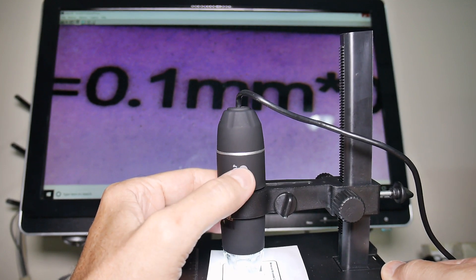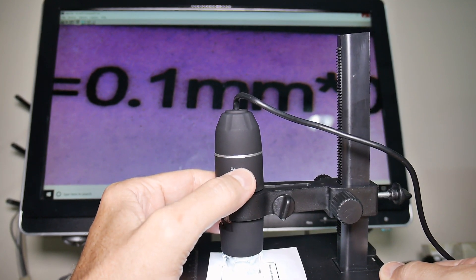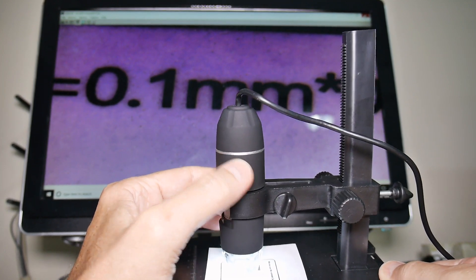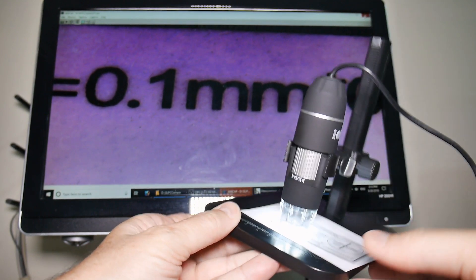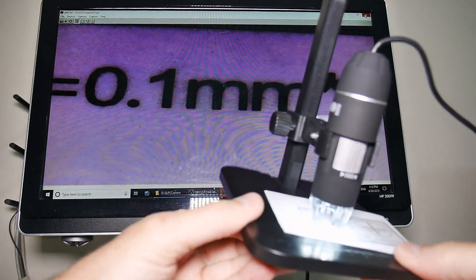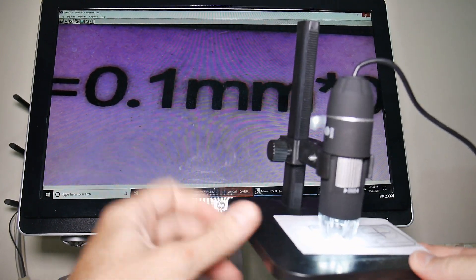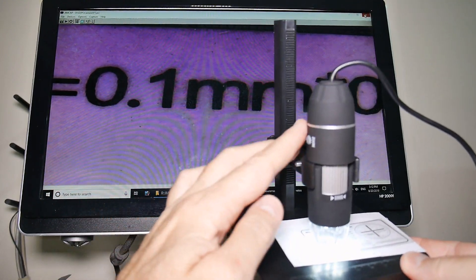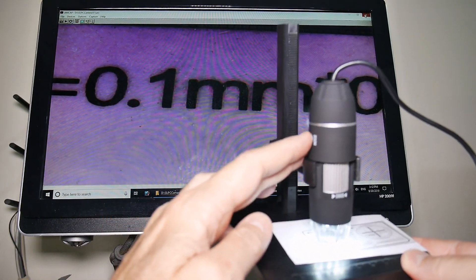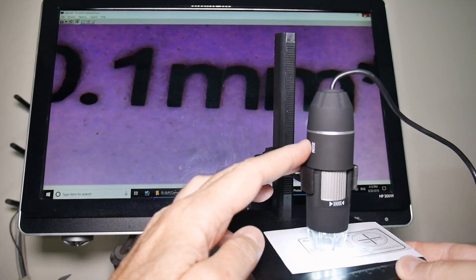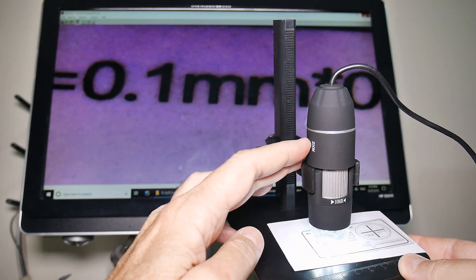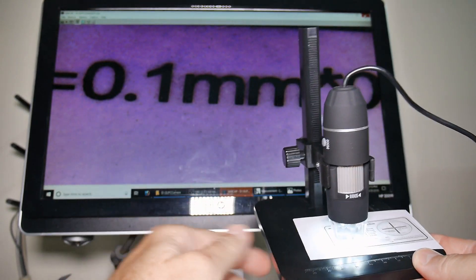This is a snapshot on this side. When I push this, it'll take a picture - you can hear that. On the other side is a zoom. When I press that, it'll zoom like four times - three, four - and then it returns back. It's a virtual zoom.